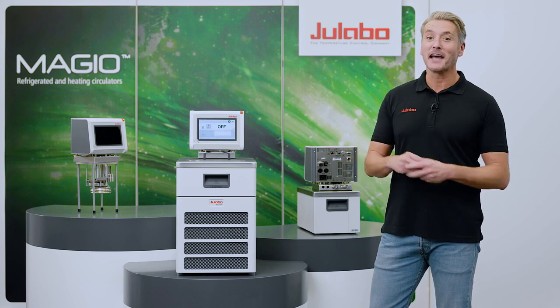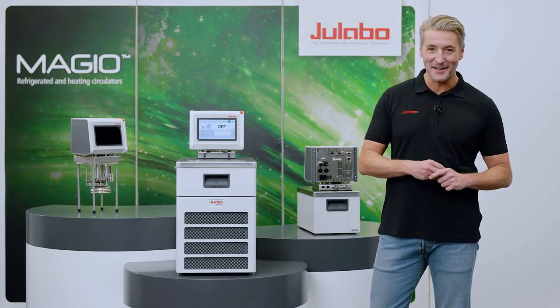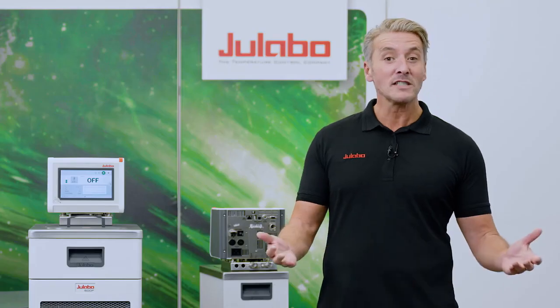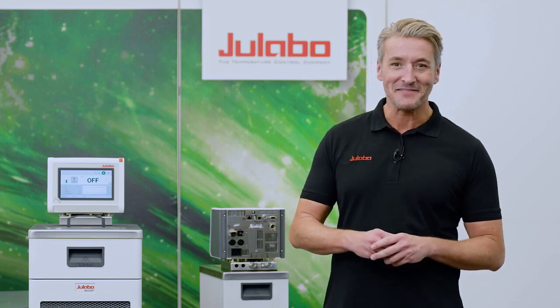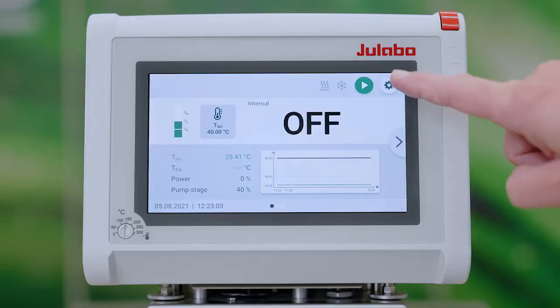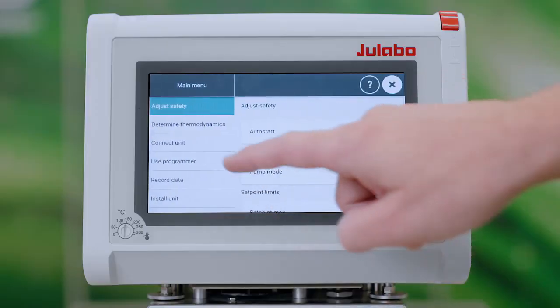My name's Alex and today I will show you the basic settings of our Magio circulators. All display functions are easy to operate with a fingertip. Let's have a look at the Magio menu. Here you can choose the submenu settings.